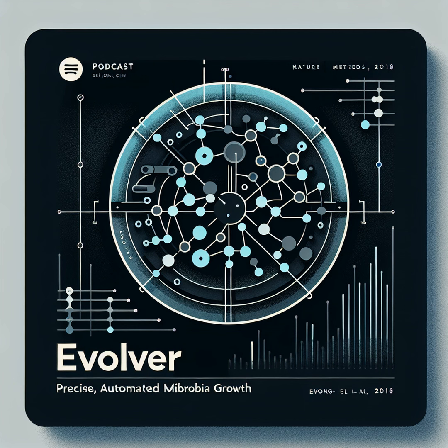Precisely. This technology is not just about incremental improvements, it's about fundamentally changing the way we conduct biological research. It's pushing the boundaries of what's feasible in terms of experimental scale and control. And let's not forget that eVOLVER is also a testament to the power of open-source design and collaboration. Making this kind of technology accessible to a wider community of researchers is crucial for accelerating scientific progress. Absolutely. That democratization of access will undoubtedly fuel innovation and collaboration across the field. It's a truly inspiring achievement.